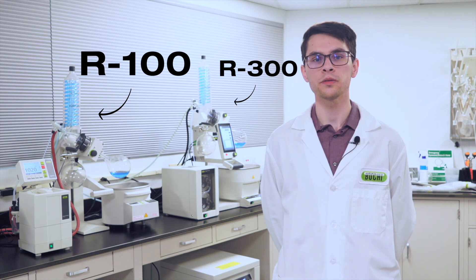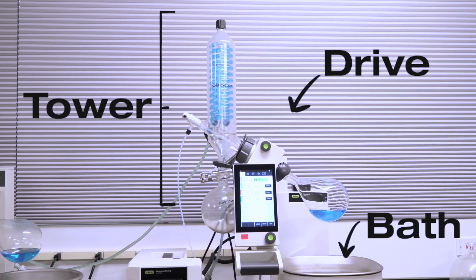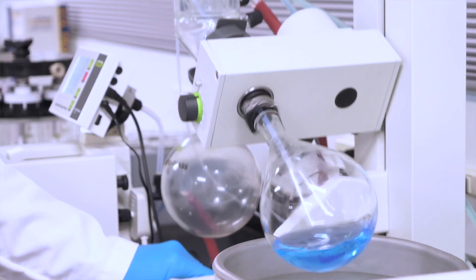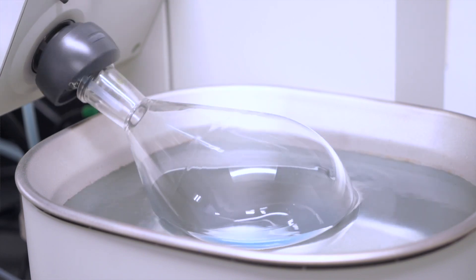The main components of a rotovapor are the tower, drive, and bath. The tower has a lift for moving samples in and out of the heating bath, which provides the thermal energy needed to drive evaporation.